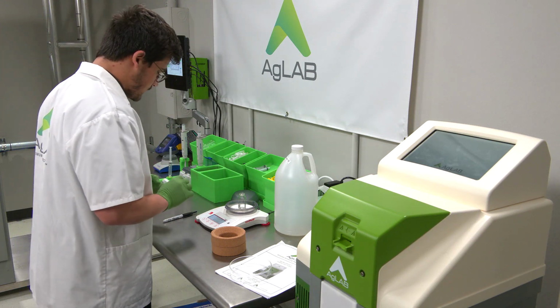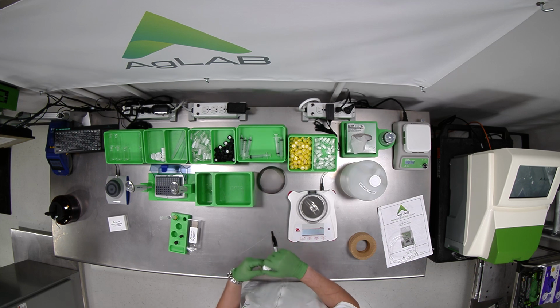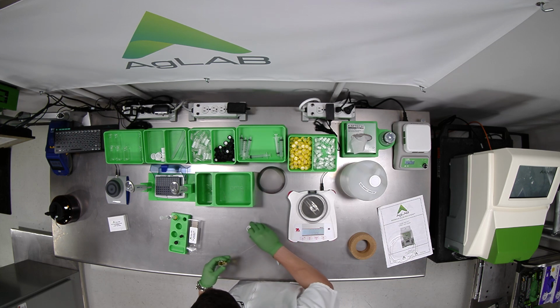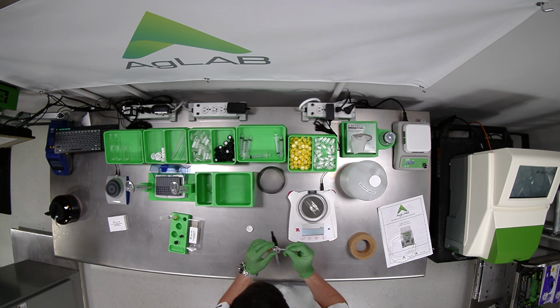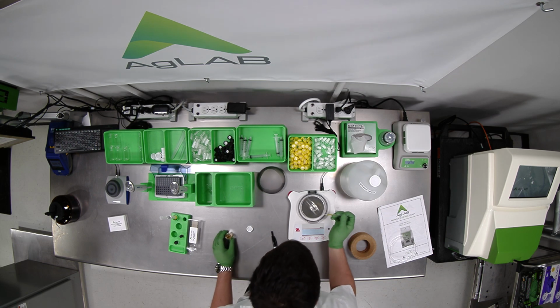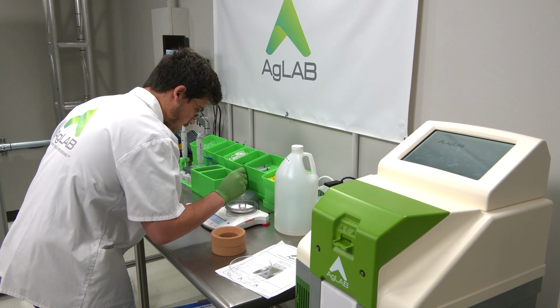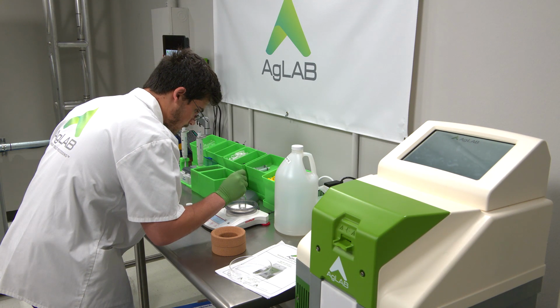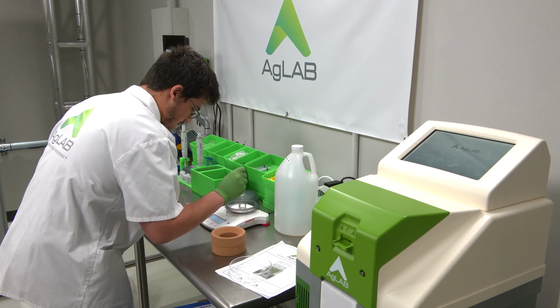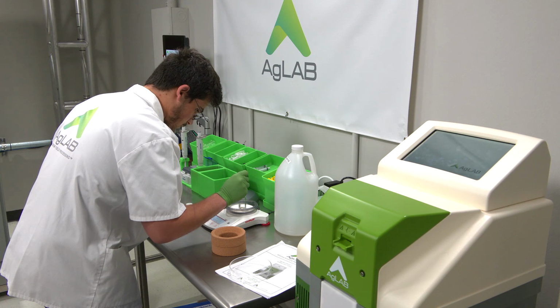All right, for head samples, I prefer to weigh with the little droppers here. Makes it a little bit easier once you get the hang of it. It's pretty easy to hit your mark every time. So for head samples, we are shooting for 50 milligrams or 0.050 grams. Okay, you want to avoid touching for sure. There you go. I usually get my first drop there to kind of gauge how dense the material is. So this stuff looks pretty heavy, so I'm going to do one more drop and see where I'm at.